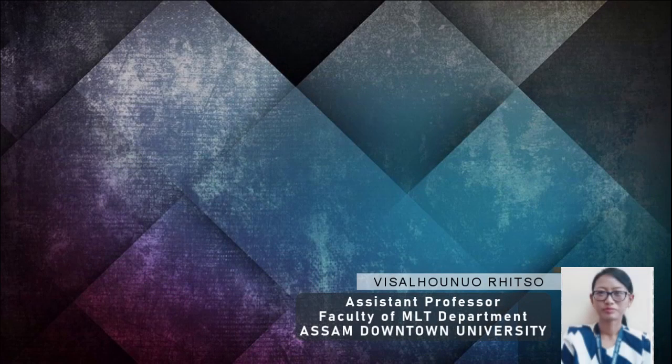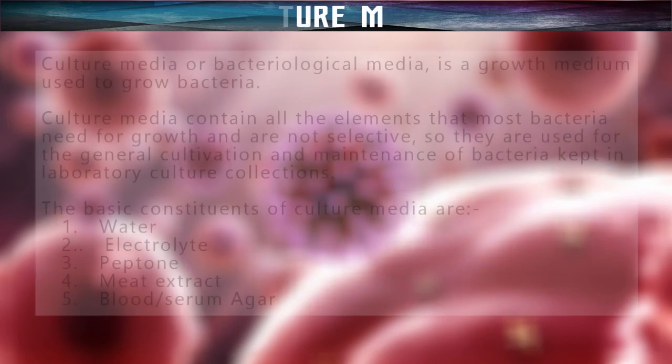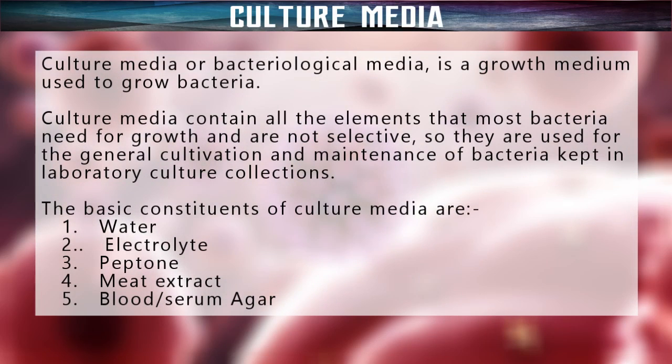In this video, I'll be explaining the preparation of culture media. This culture media is a growth medium used to grow microorganisms like bacteria and fungi, or in other words, it contains everything that the microorganisms need to grow outside the body and under laboratory conditions.